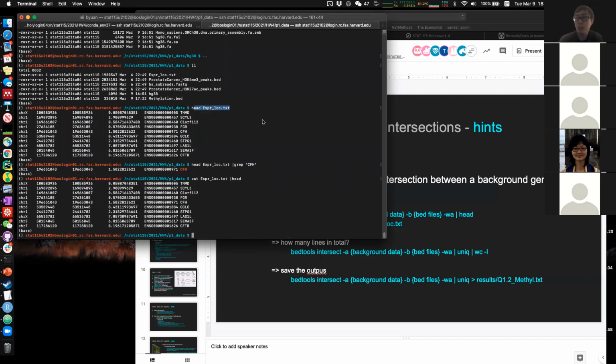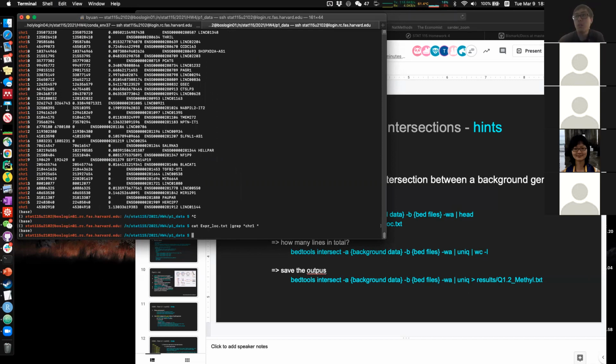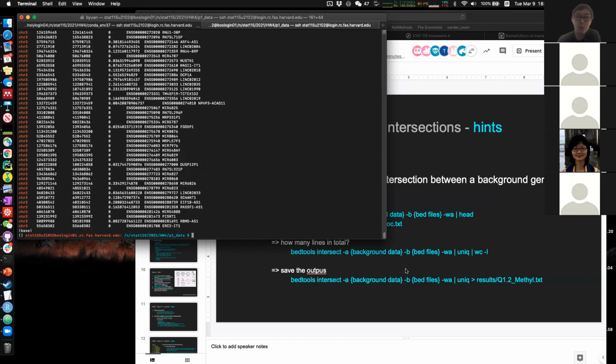So just taking the head directly. Or I want to cat all the files, and I want to first search for all the chromosome 1 genes. Okay, and that will give you a lot, right? Let's try chromosome 3. Okay, so that would give you only chromosome 3.